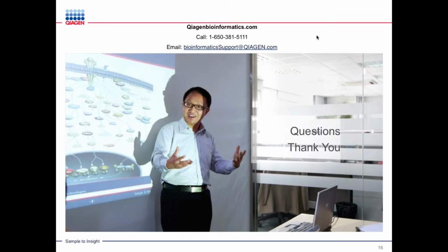Okay, so we have time just for one more question, and we have a lot of questions, AJ. So I have to select the one that will work here. There is a question about how to compare variants between two groups of samples. Example, 4 samples with the same phenotype in one group.